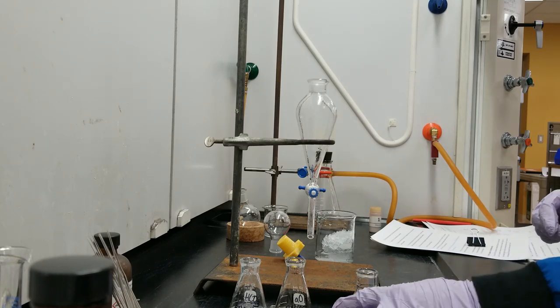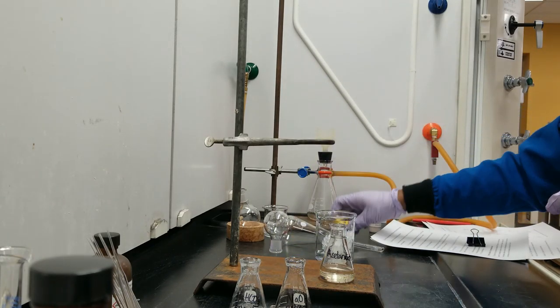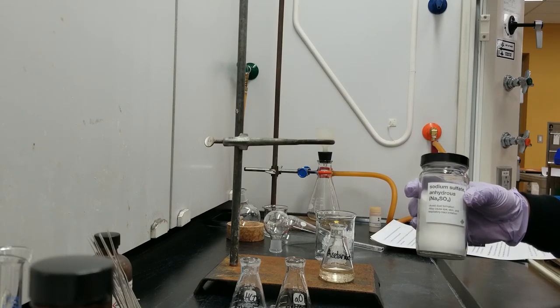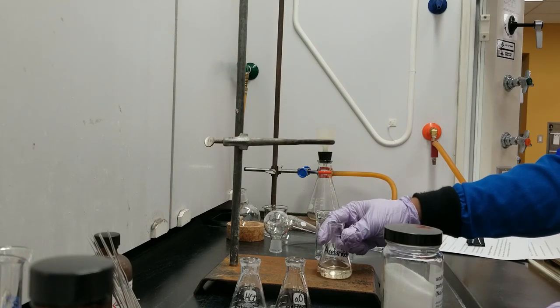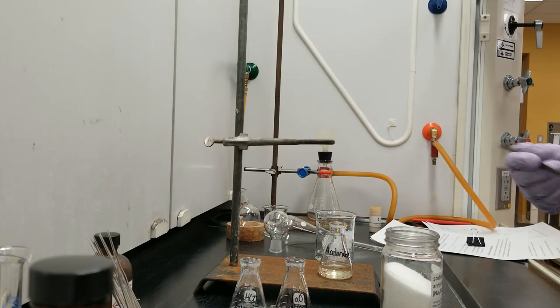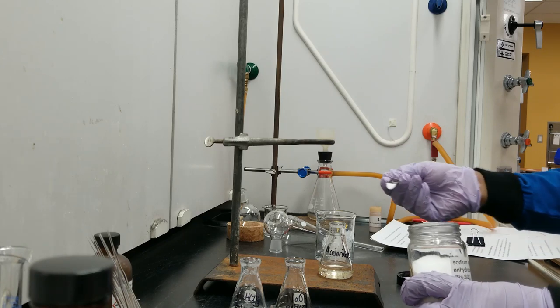Okay, the next step is to dry the organic layer, or the acetanilide, with anhydrous sodium sulfate. Sodium sulfate is a hygroscopic solid which takes up all the water. So if we have any water or aqueous part in the acetanilide Erlenmeyer flask, we must get rid of it by adding sodium sulfate. So we add sodium sulfate in portions.